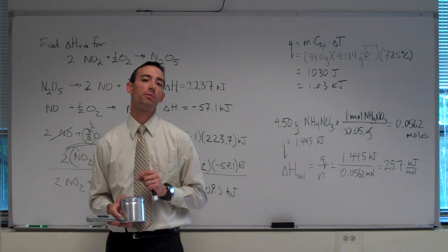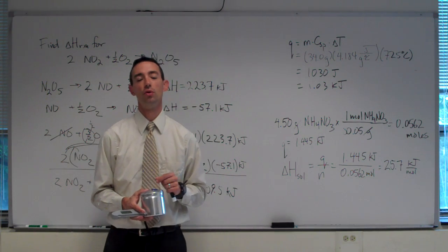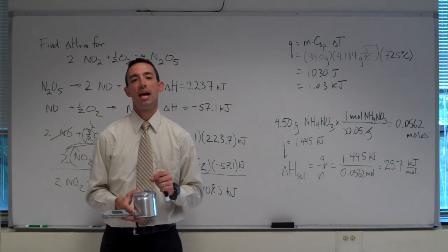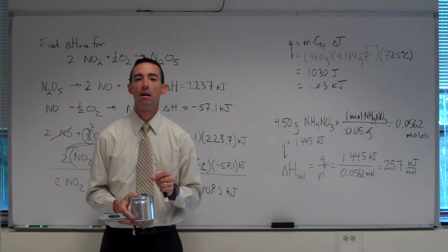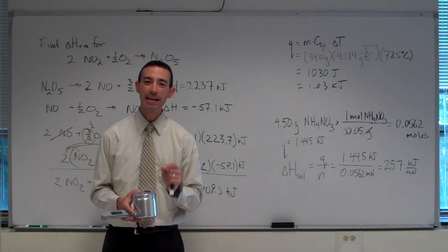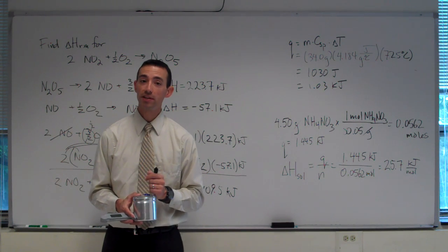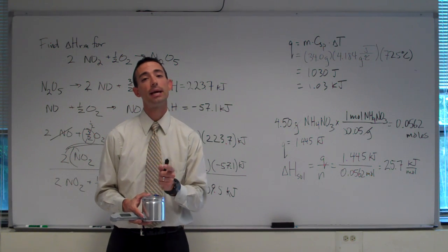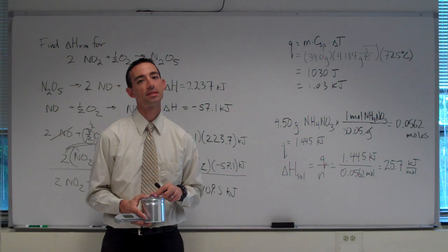I could direct you to some news articles, unfortunately, that have appeared in just the last year or two, where students in chemistry labs at other colleges and universities have inadvertently disposed of their waste in the wrong container and been harmed because of an explosive reaction that occurred immediately when the waste was put into the container. So it's a serious concern how you dispose of your waste, and be sure that you read a label before you dump the contents into the bottle, particularly with acids and bases.